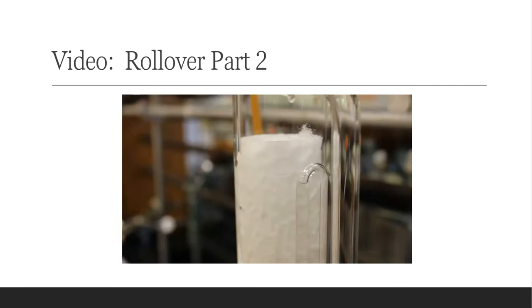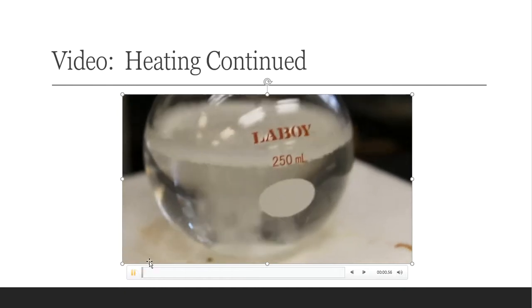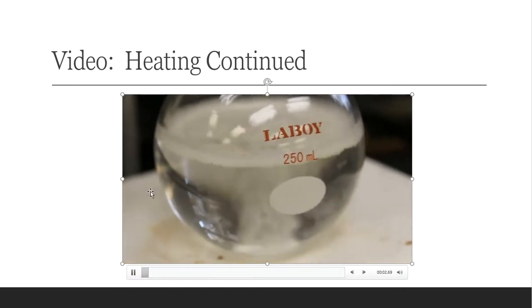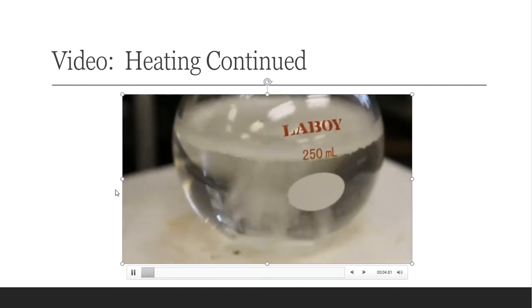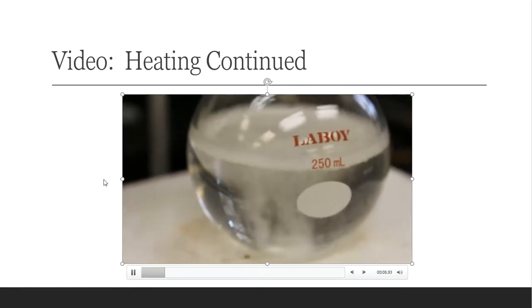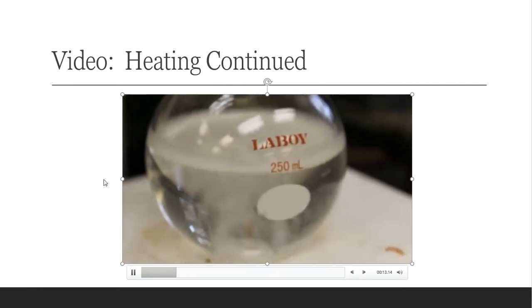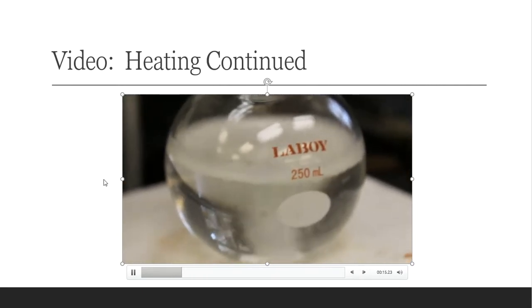All right, so here is the heating. It's going to continue to heat, and again, it's just a follow-up video with the rollover. We are about 1 hour into my Soxhlet, and I've got many, many more hours to go. Try 16 to 18 more. Yeah, 16 to 18 more hours. I've got to let this thing go on for days.